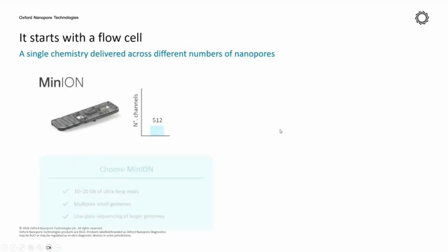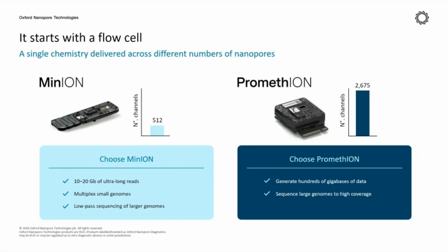So the sequencing device. Before we look into the sequencing machine, these are the flow cells. This is where we put in our DNA samples, and this is also where the signals are measured while the sequencing is running. There are two types of sequencing flow cell. One is the MinION flow cell. The throughput for this MinION flow cell is lower. So for simple cases like sequencing a bacterial genome or sequencing perhaps amplicon metagenomic samples, normally the MinION flow cell will be sufficient to provide enough data throughput for research purposes.